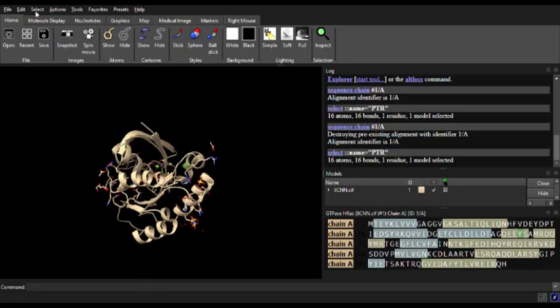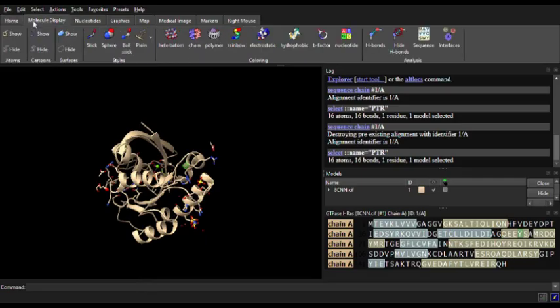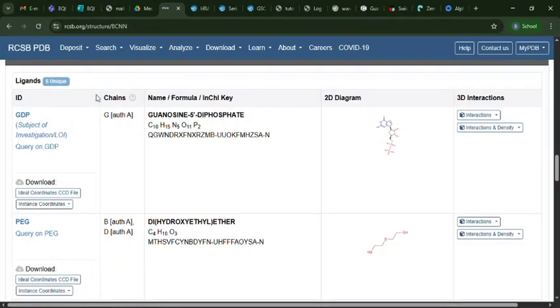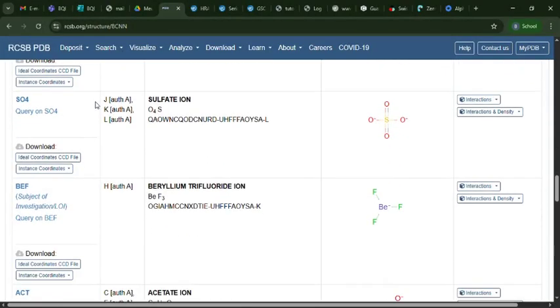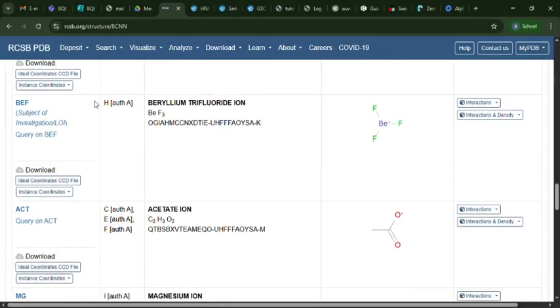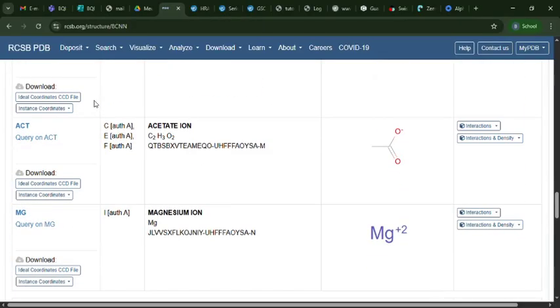First, if your display is showing home, I suggest you go to display. From display, molecular display, you see everything concerning that molecule. What you now do is go to sequence. Remember, this is an experimentally derived protein structure, but we want to predict it using AlphaFold 3.